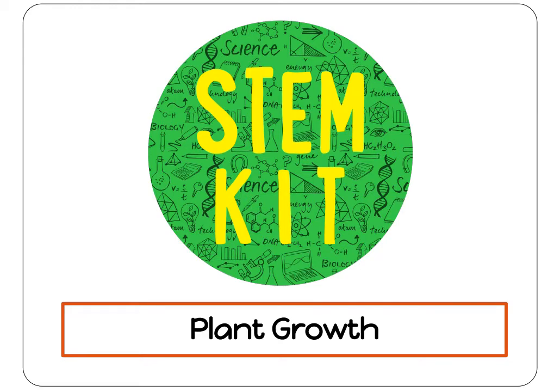Welcome to STEM Kits from iBio Institute as we explore the germination of two different types of seeds, corn and Wisconsin fast plant seeds. This video will guide you through two extended experiments, the observations of corn growth through a germination necklace and the building of a set of self-watering growth systems that we will use to conduct a simple controlled experiment about the effect of fertilizer on plant growth. My name is Kathy, and I will guide you through this investigation.